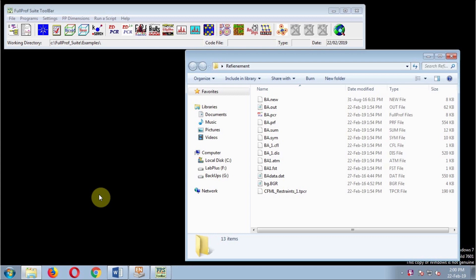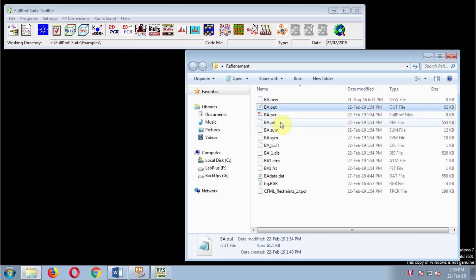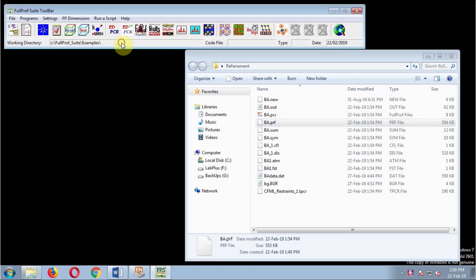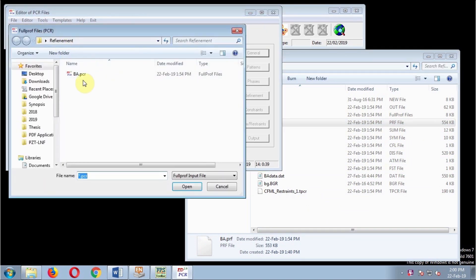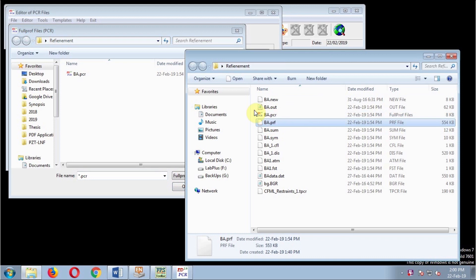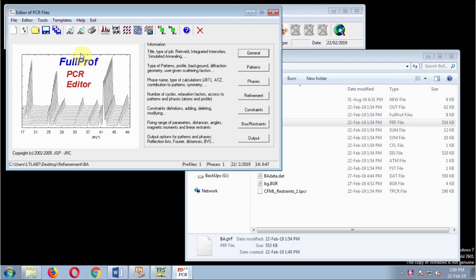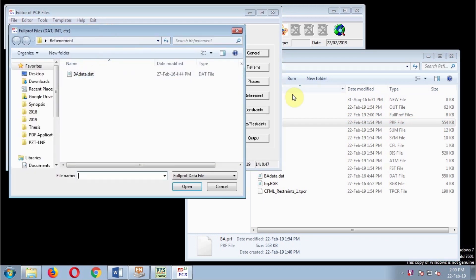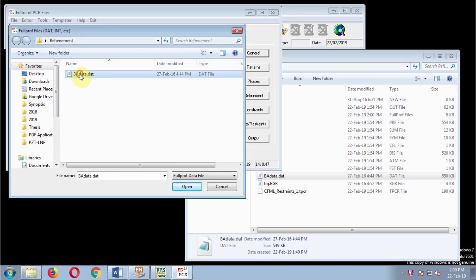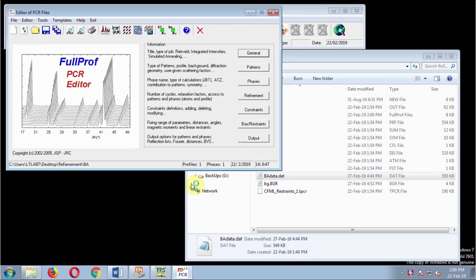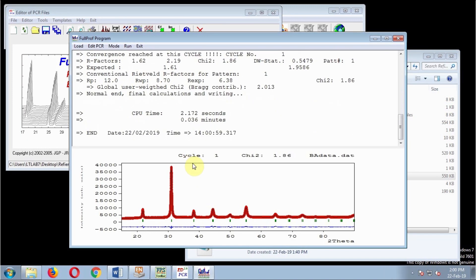When you are done with refinement, you can locate all useful files in the folder where you saved your PCR file—output file, PRF file, and others. Let's open the final refinement PCR file. I'm not going to change anything, let's just run it once. This is the graphical result.